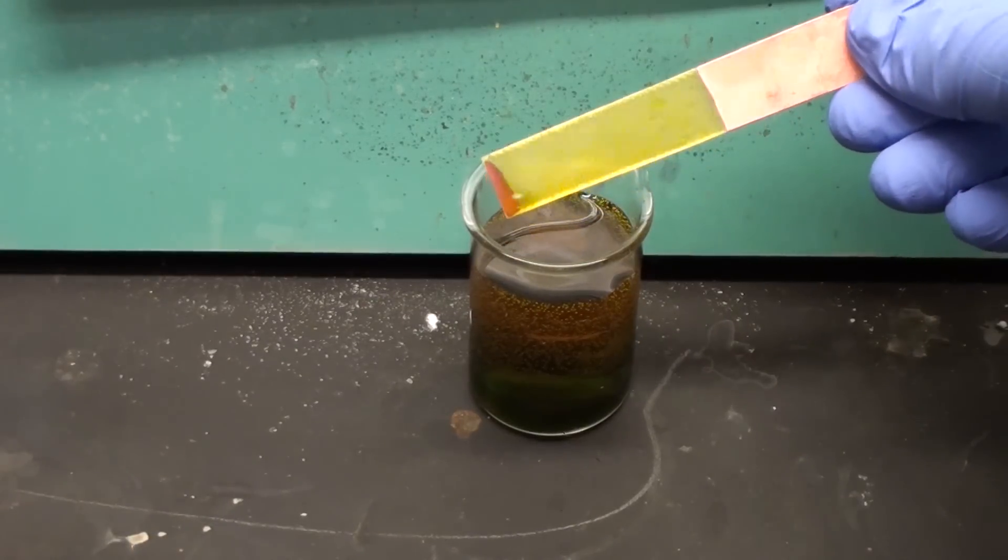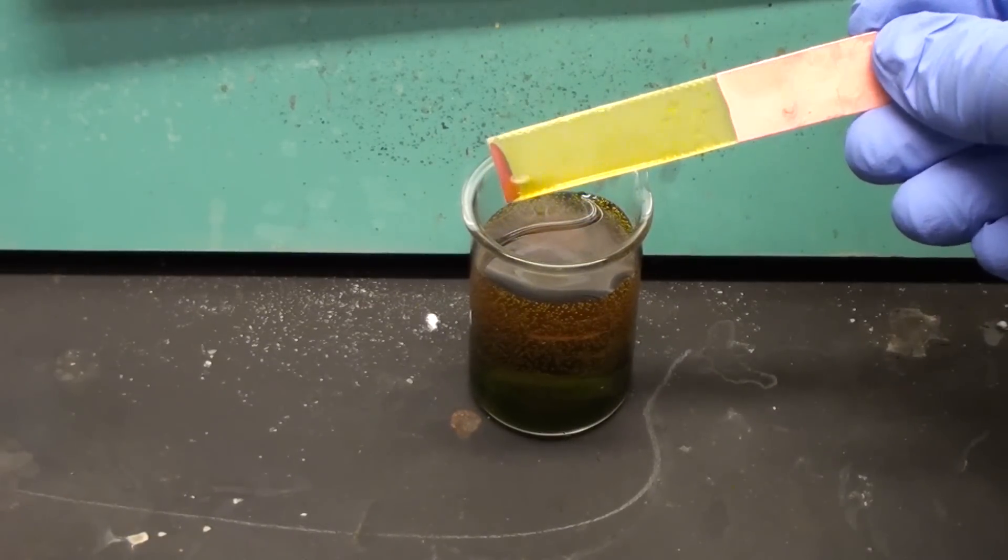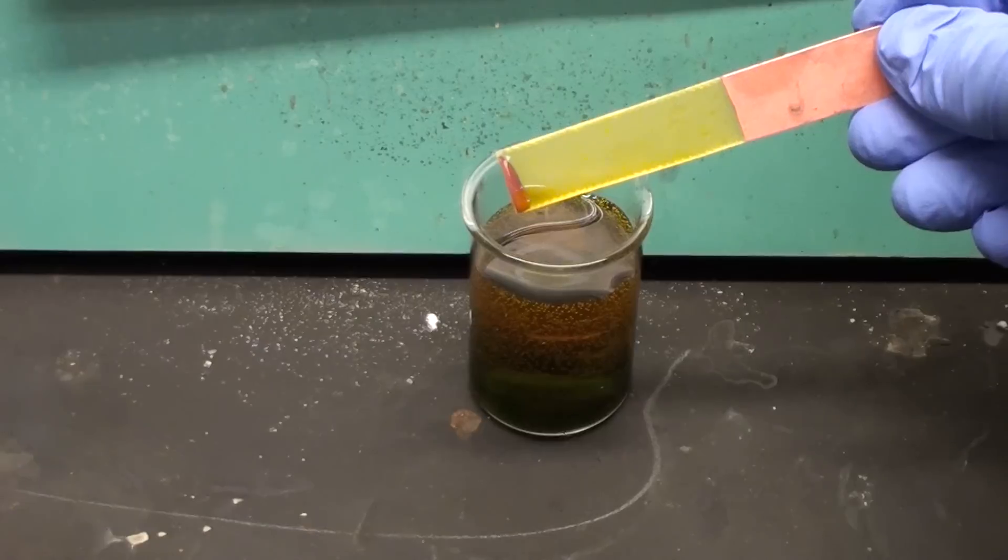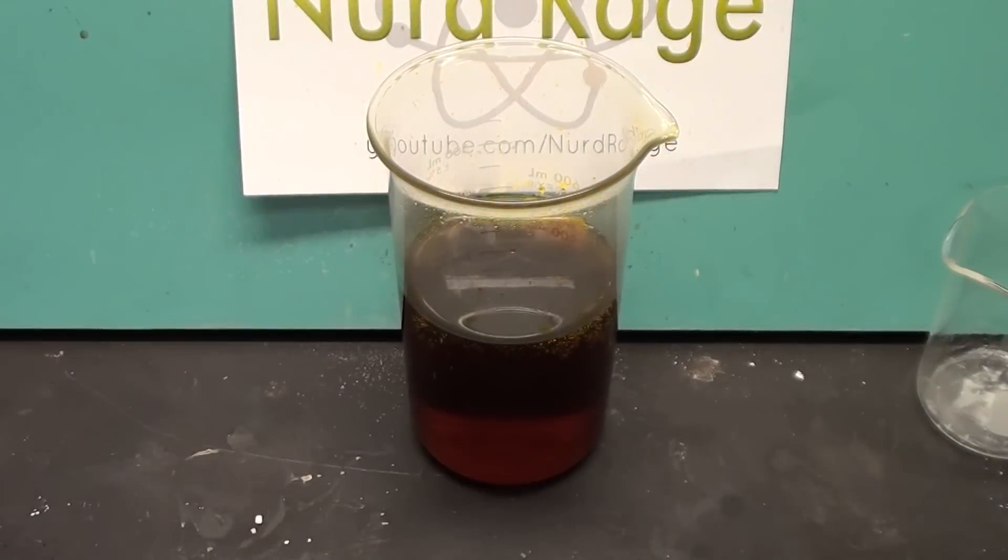Obviously in an actual PCB production run you would stir the mixture so you don't get that small piece of unetched copper at the bottom. Anyway we have successfully made ferric chloride.